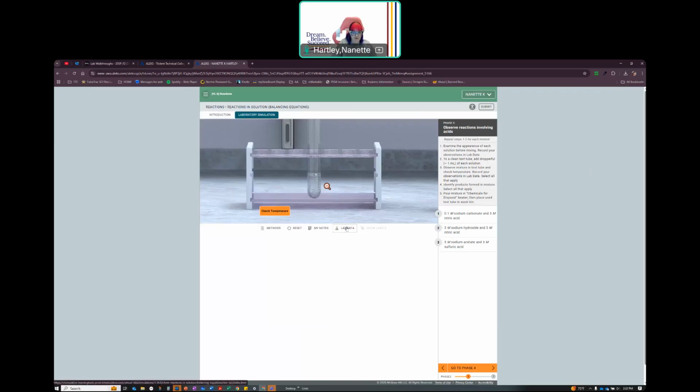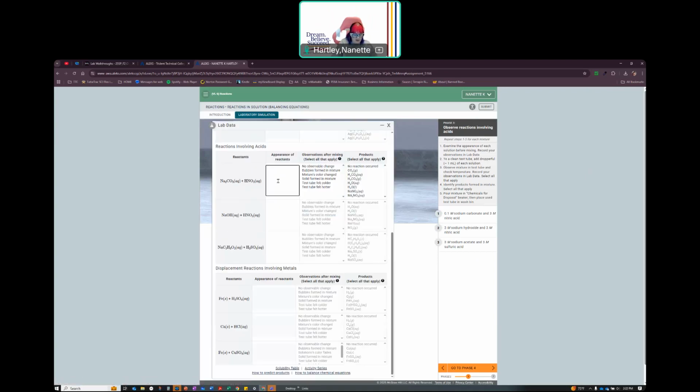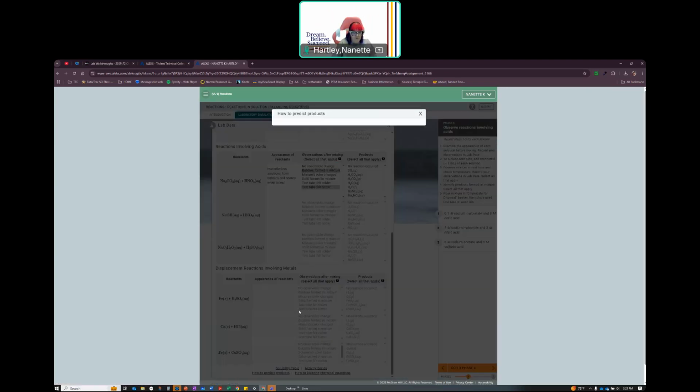Okay? So I'm going to open this up. I have two colorless solutions, form bubbles, and heated when mixed. So bubbles form in the mixture. Test tube feels hot. So what are my products here? Well, okay. So I need to look and see how do I predict the products. So let's go look at that.